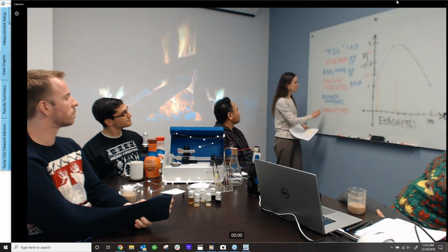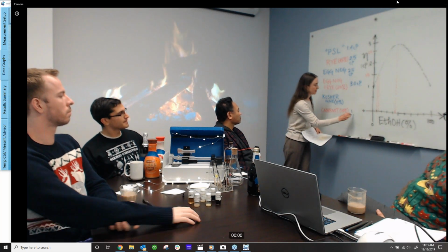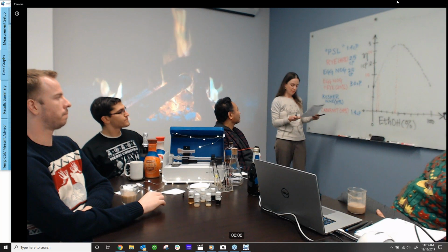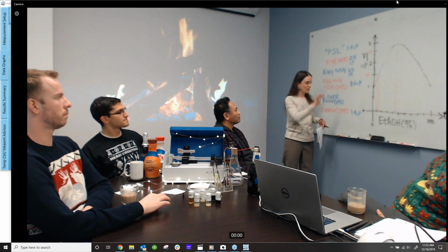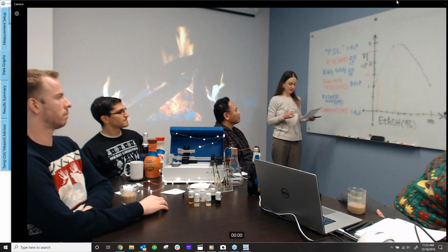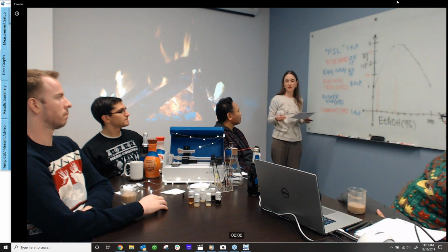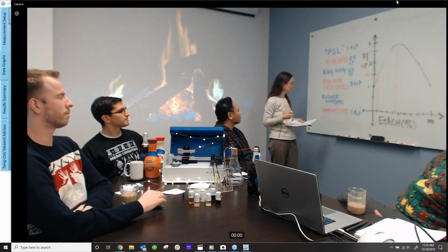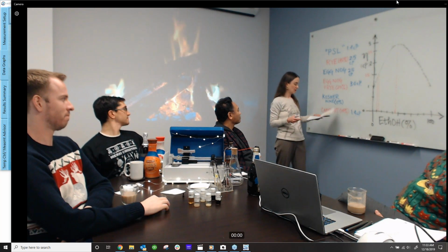I'm going to jump to the Cabernet before I get to the sweet wine. This one was coming out somewhere around 1.4 centipoise. Again, we know from the bottle that this is about 14% alcohol. So if we look at our roughly sketched curve here for viscosity versus ethanol content, that's about reasonable for that alcohol content, given that other than that, it's predominantly water-based.